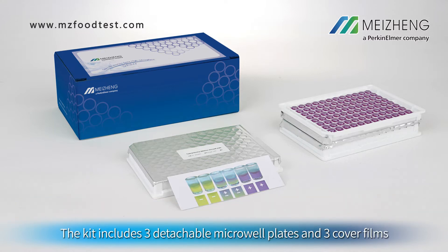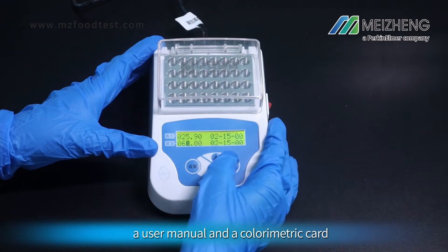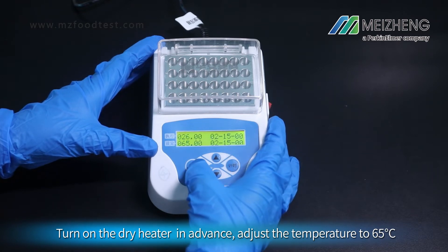The kit includes 3 detachable microplates and 3 cover films, a user manual, and a colorimetric card. Turn on the dry heater in advance and adjust the temperature to 65 degrees Celsius.